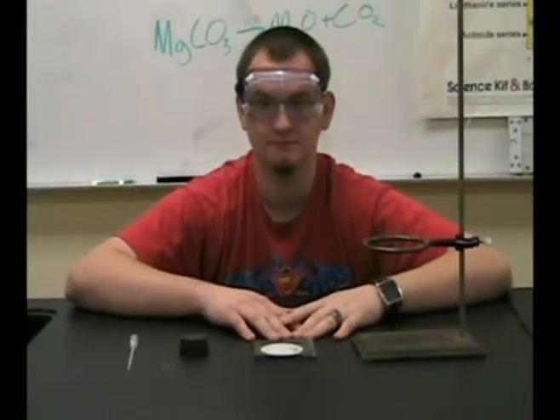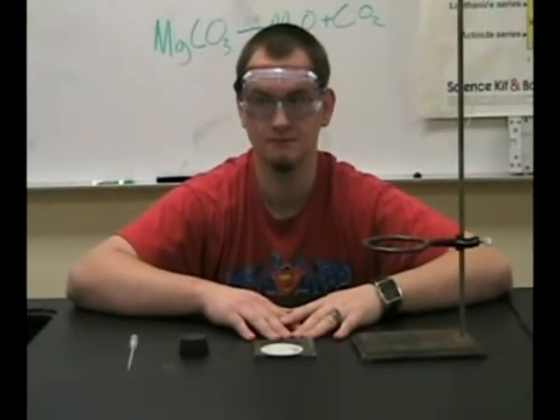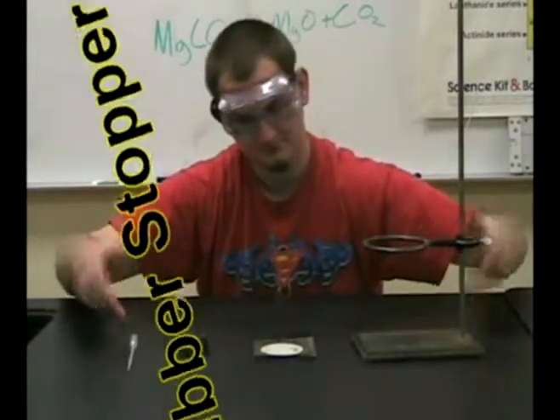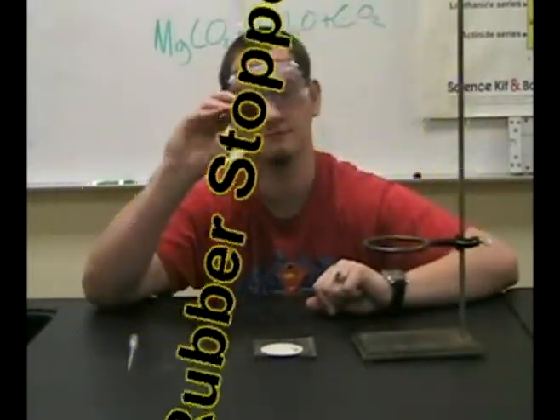Now, we're going to show you some miscellaneous items. These are items that you will probably use, but we couldn't think of a classification for. The rubber stopper. Rubber stoppers are used to prevent gases and liquids from escaping bottles.